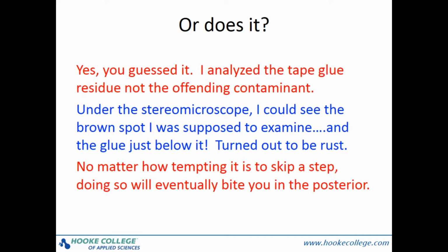I didn't examine the sample visually. I didn't examine the sample by the stereo microscope. I didn't think before I act. I just jumped in, hoping to get the job done quickly. I almost embarrassed myself, or even worse, sent people off on a wild goose chase. I did in fact see a small bit of brown, looked at that brown, and it was a piece of metal which had gotten into the ball as part of the polishing process. So, no matter how tempting it is to skip a step, doing so will eventually bite you in the butt.